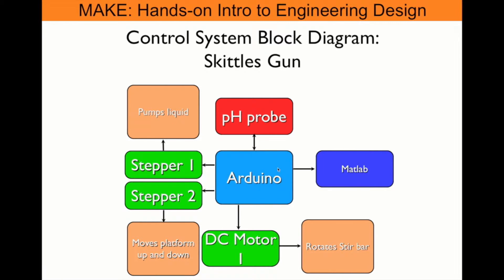When you turn the machine on, the Arduino will initially send the signal to stepper motor 2, which will actuate the platform up and down.